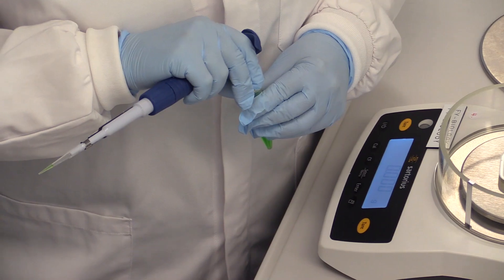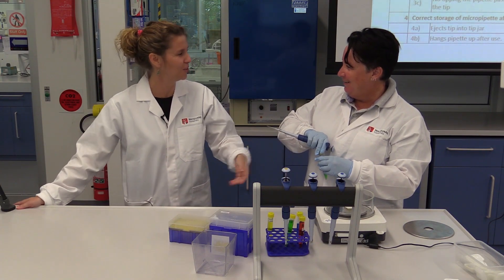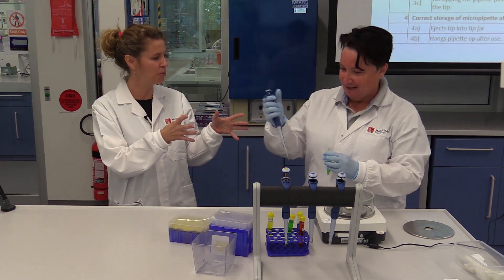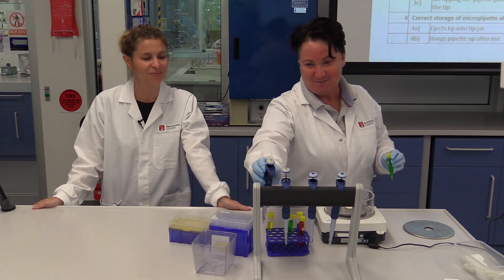Oh my God, Michelle. What? I've been working on bacteria and you're doing that. You're contaminating all your pipette! Oops. Okay, so I shouldn't be doing that — just keep the pipette upright. Let me try again.